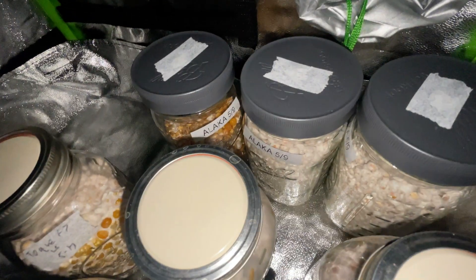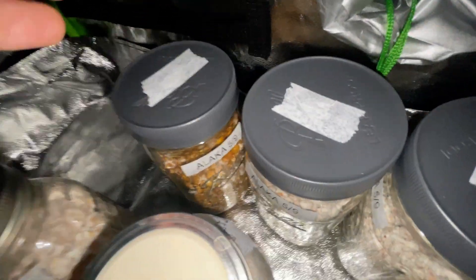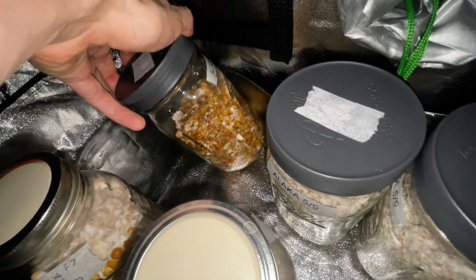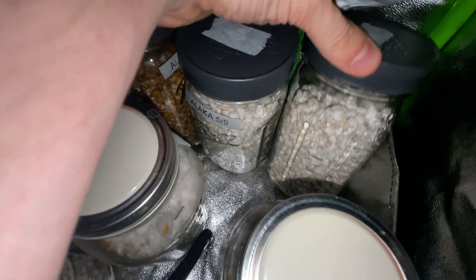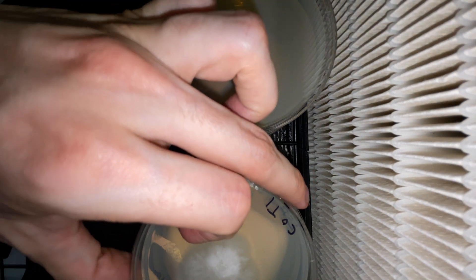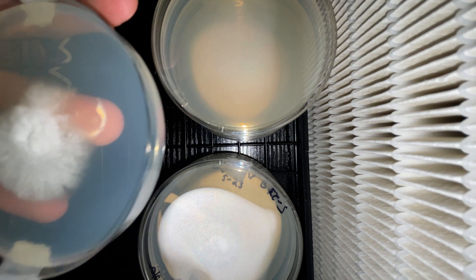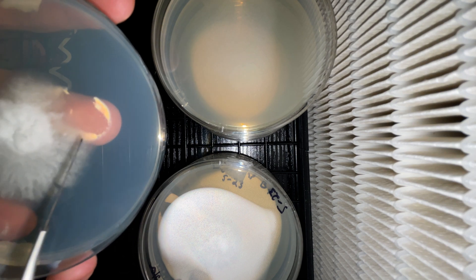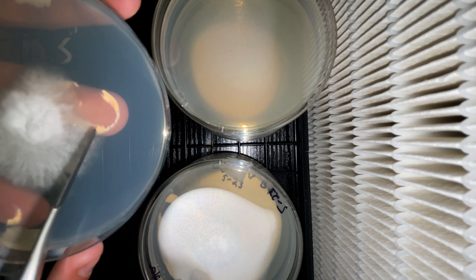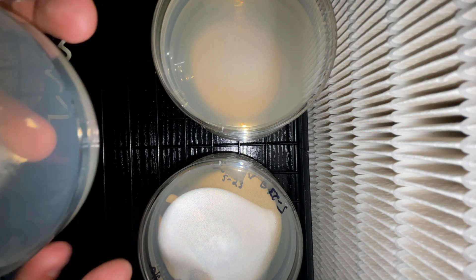The reason I made this CVG is to spawn our colonized grain. This is our grow-along, at least one of the parts of them. We also have the clone plates that we're working on. Two out of the three made it, so they'll be getting spawned into a 32-quart Sterilite bin. We also have our clone plate updates. These are getting transferred a little early in this stage, but I'm not too upset at all. I plan to step back from agar work for the next two to three days, and I really wanted to make sure that these guys didn't have any contamination on them, so I decided to transfer some clean growth early.